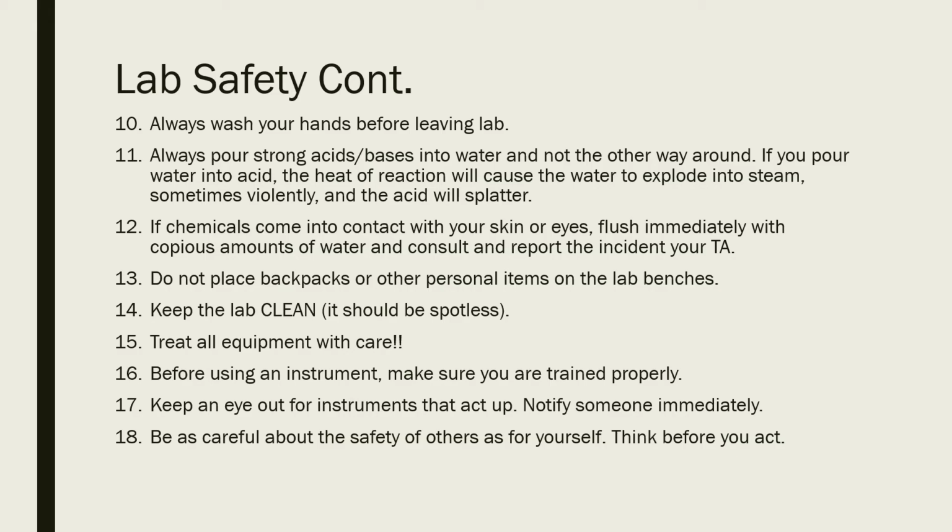Always pour strong acids or bases into water and not vice versa. Doing it the other way around can cause a reaction that will cause steam and smoke to come out. And depending on how much you add, it could be violent and will cause the acid to splatter, getting onto your skin.